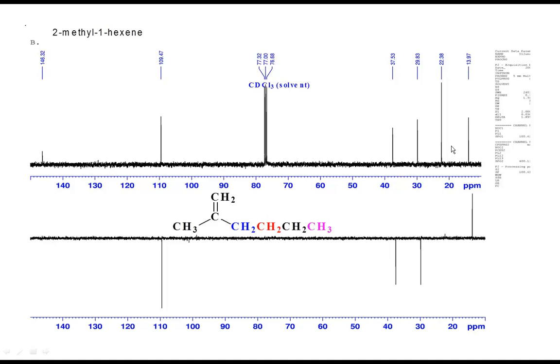So let's count 1, 2, 3, 4. This is pretty much missing. Could be some solvent, some acetone peak maybe. Okay, anyhow, let's ignore this spectrum and come back to this later on. Let's see what they are assigning to. Where is the other CH2? CH3 and CH2, okay, they're overlapping. But still you should be able to see CH2, right?